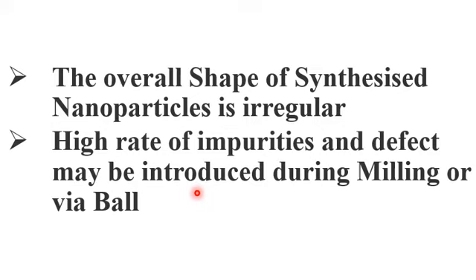So what this means, students, is that if you have impurities or defects in a material prepared by the ball milling process, then this technique is not common for the microelectronic industry, because every time you prepare a material with the ball milling process, you will get impurity and defects.